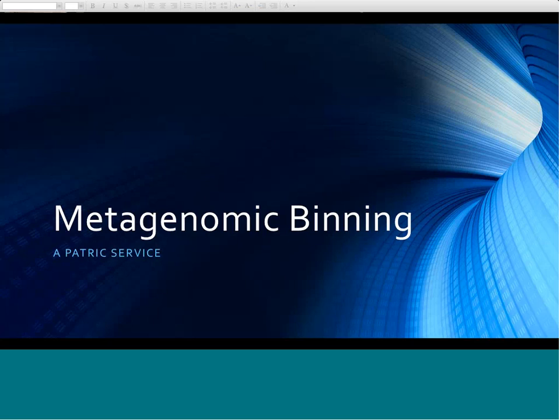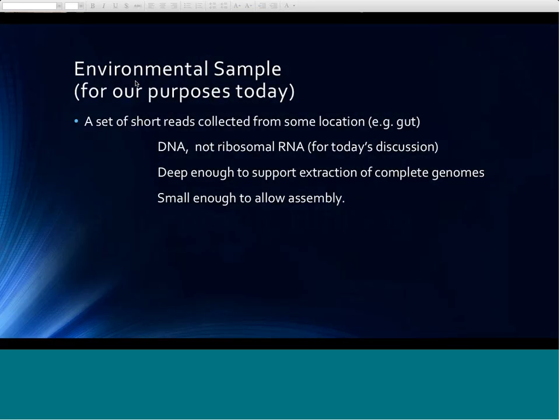We call the app binning, metagenomic binning. And the goal of it is to take environmental samples and reconstruct near-complete genomes from them.